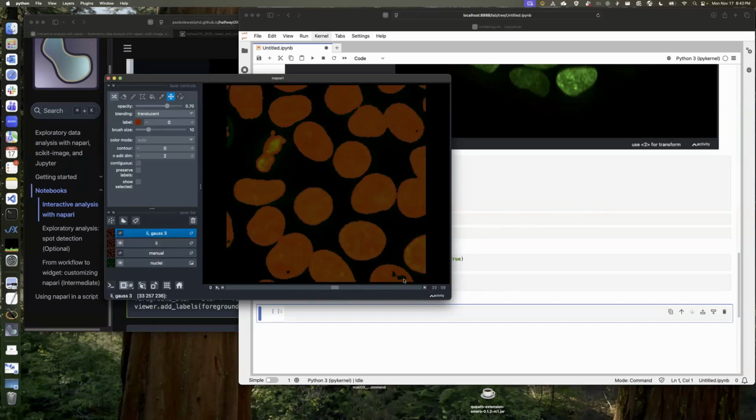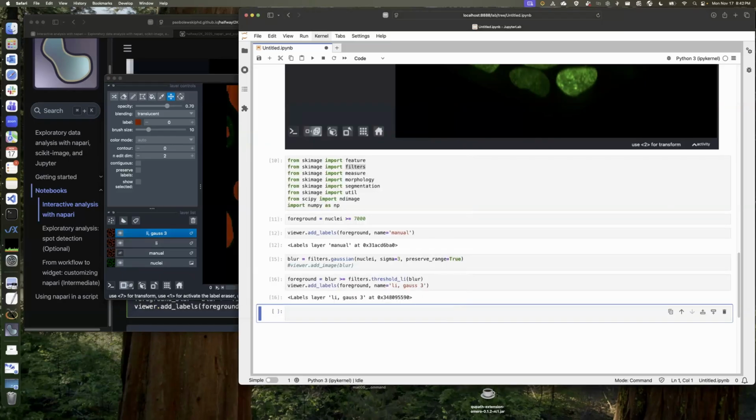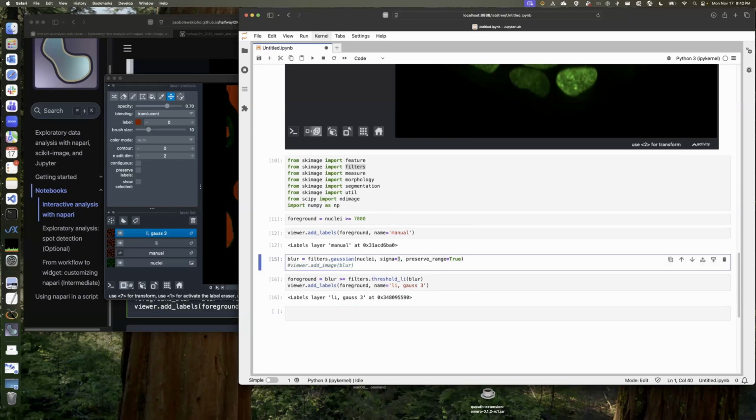And one thing I notice is that when I use a Gaussian sigma of 3, those holes get filled. But I also notice that there's some spillover. Notice how this is connecting in a much wider way versus the 1.5. So this is the kind of trade-off. I can explore the influence of the parameters by playing with the values like that. So I think I'll pick a middle value, 2. That seems fine.